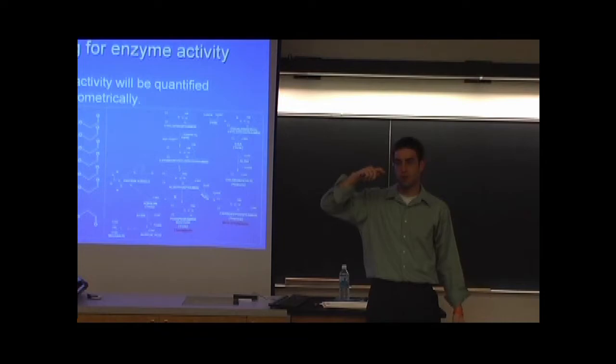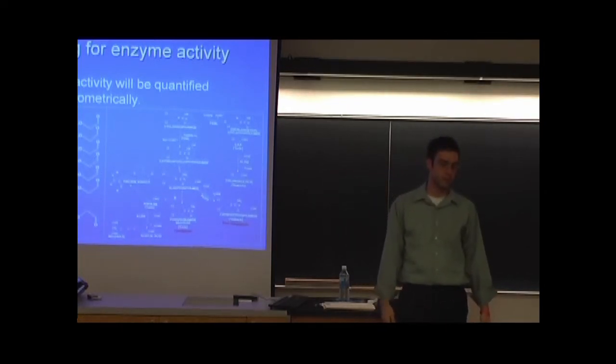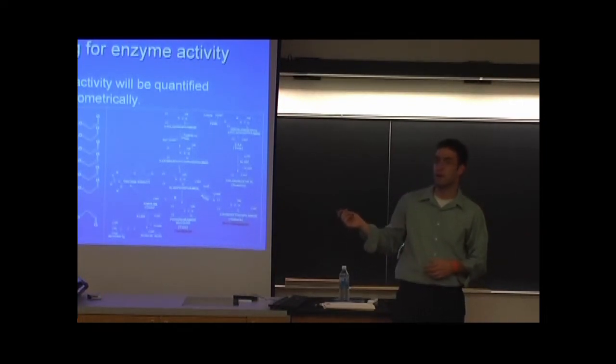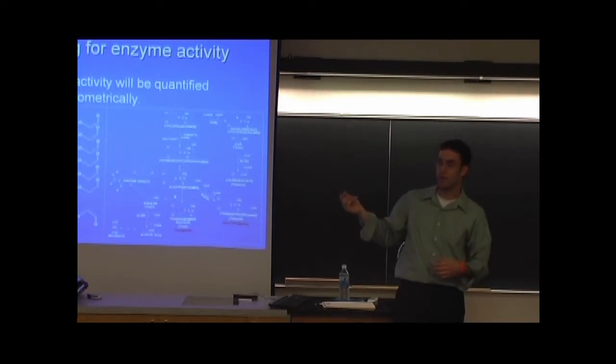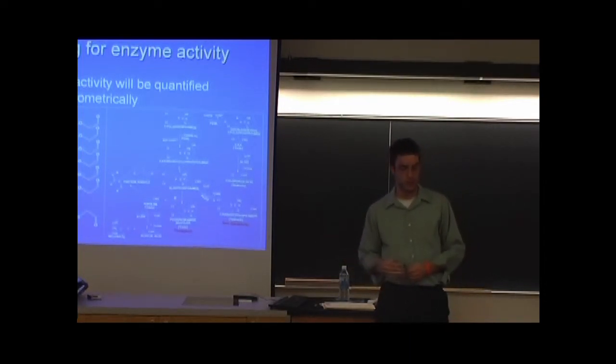And then you have the first part of the start codon and the first part of the sequence from there, and then the stop codon for the first reaction. So you had the upstream primer began right with the start codon? The primer didn't start right with it. It had a sequence for your vector that you're going to put it into initially, so it could bind with your vector, and then it has sequence-specific stuff for your ALDH5A1 gene that will allow it to bind with the gene as well.